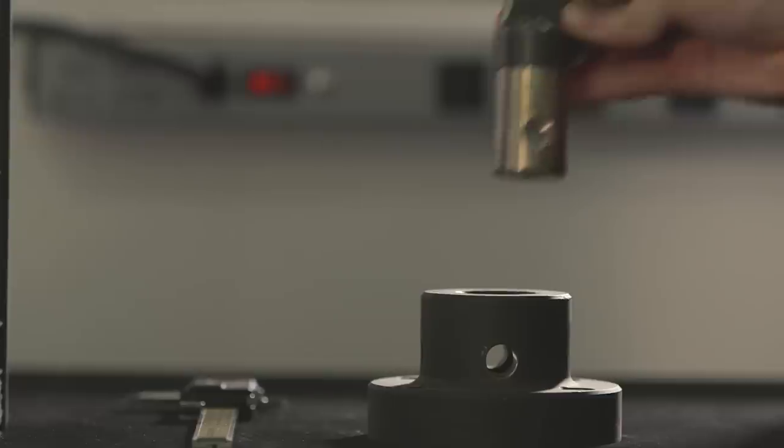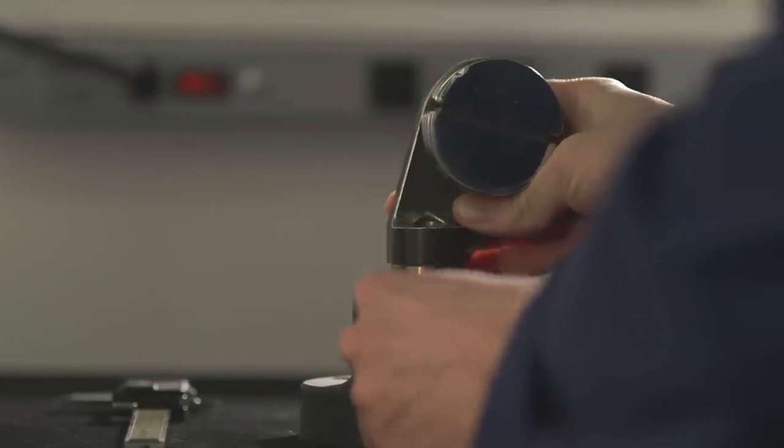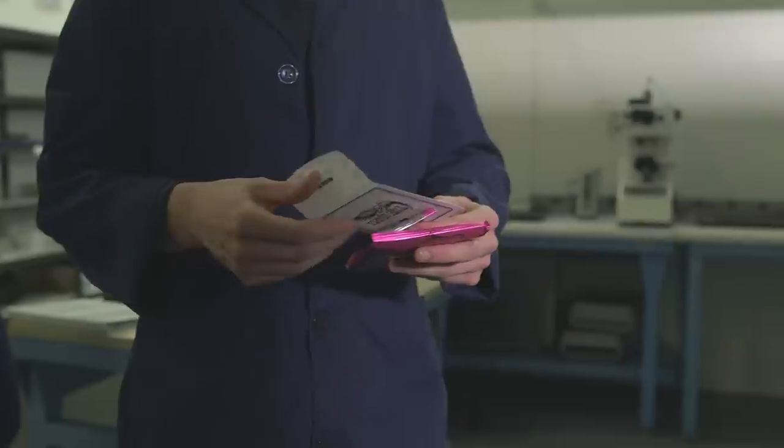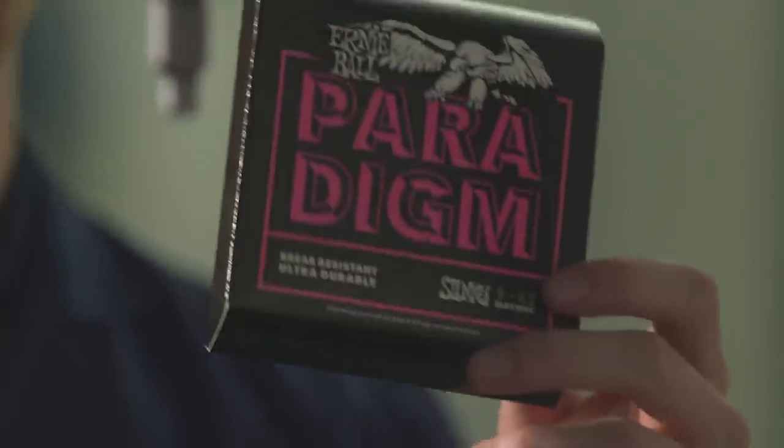Today we're testing a series of guitar strings. The objective of the analysis is to compare the modified Paradigm string to other industry leaders producing traditional strings.